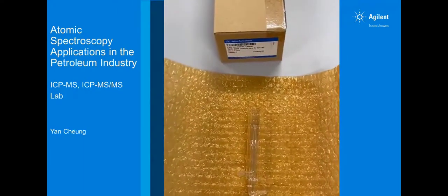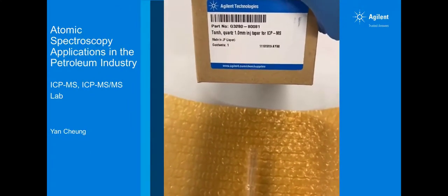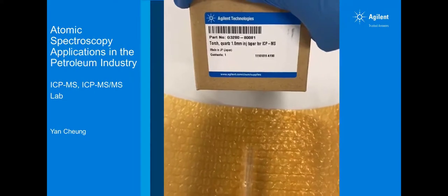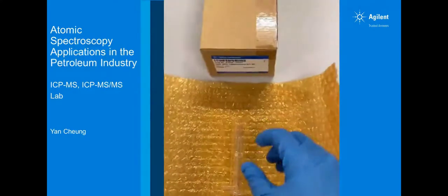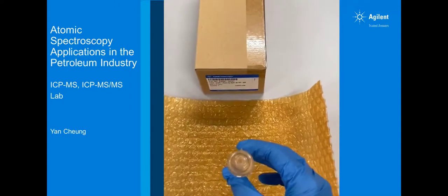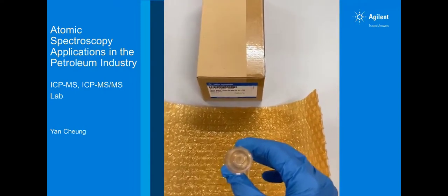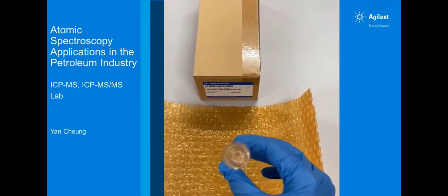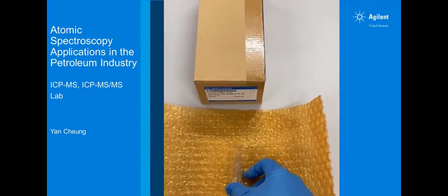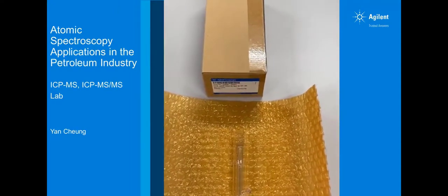Now in terms of the torch, it's recommended to use a torch with a smaller injector inner diameter. So this one I'm showing is a 1 millimeter inner diameter injector torch. The purpose is to minimize the organic solvent reaching the plasma to avoid solvent loading of the plasma. I'm holding up the torch. As you can see, the innermost quartz tube is the injector, and it's a very small 1 millimeter injector. That's opposed to the aqueous analysis that typically uses the 2.5 millimeter torch.